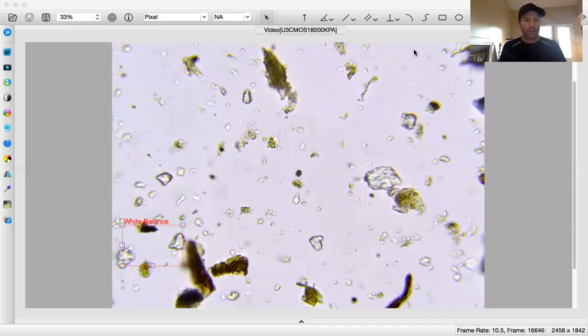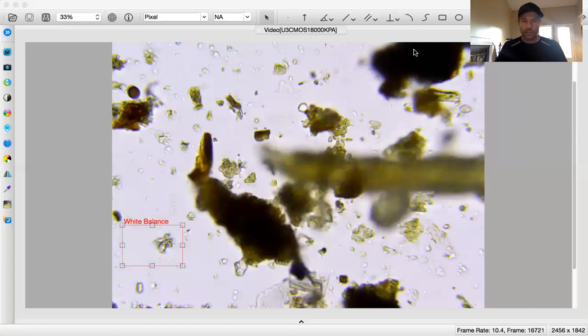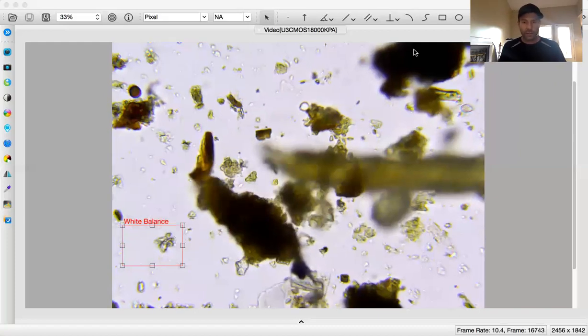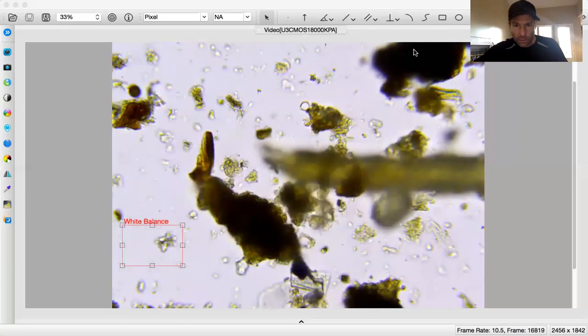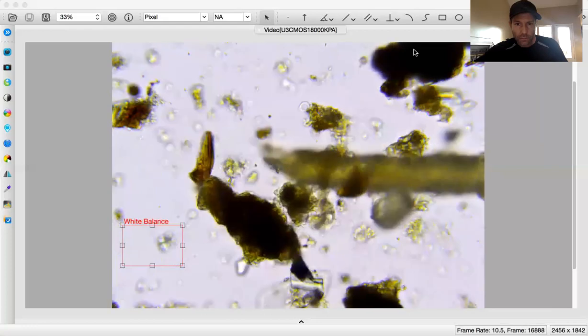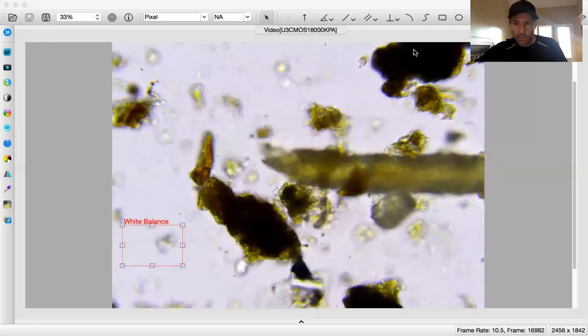We're going to start in the upper left-hand corner. So we're going to go to the upper and then the lefter, just like so. And there we have it, our first field of view. Ooh, what do we got moving around down there? A flagellate? No, looks like possibly a bacteria of some kind. Got some guys moving around down there. It's like some bacteria moving some particles.